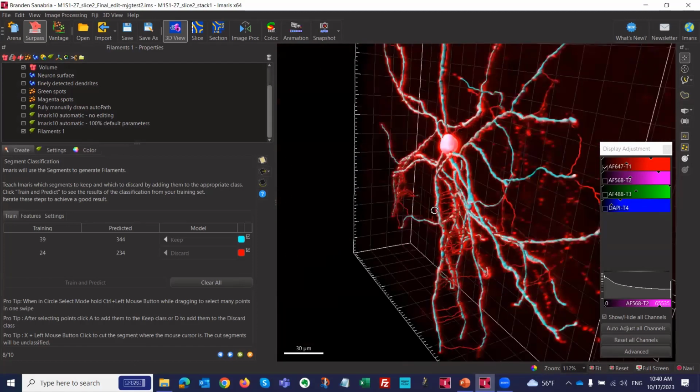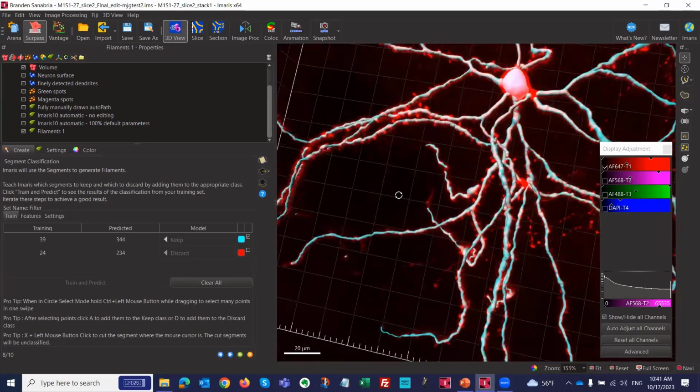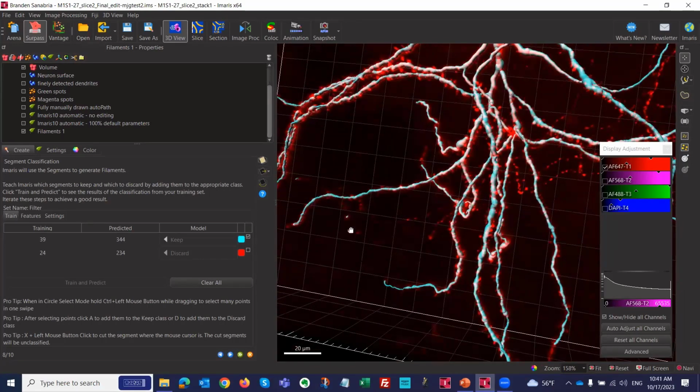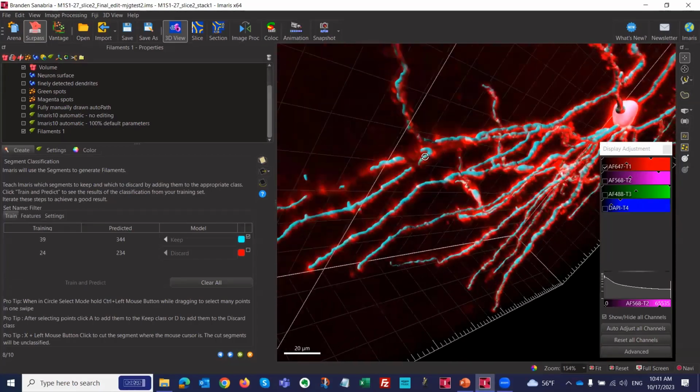Okay, so you can see here it did connect some of those, but that's what I call the guitar strings here. But it knows that it's not right. That's why it's red. It does it because of the technique of how the algorithm works. So if all those red ones are annoying for how you see it, you can also turn it off like this. So in this way, you only focus on what is keep. Okay, you turn off all the discard, and it looks pretty good. Yeah. So maybe you can just see here where there's some weird things happening, like here.